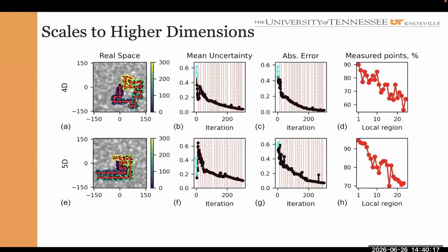This also reflects the fact that, due to the sparse compositional information, there is typically a lower probability that we will have a particle with the same or close composition within the single field of view. But with the ongoing experiment, the number of measured particles decreases with time, and our algorithm becomes more and more selective.